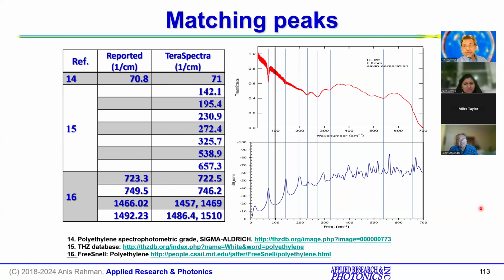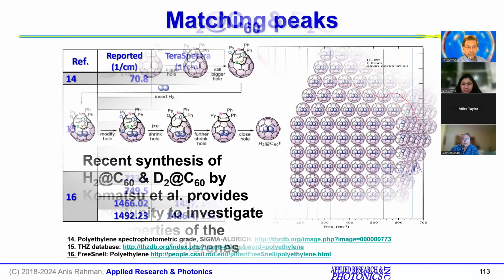This is the job for some astute scientists to sit down and figure out why we see a peak at this wave number. Is this a real one? If it is a real one, what does it mean? The tool gives us the opportunity to discover these kinds of things.